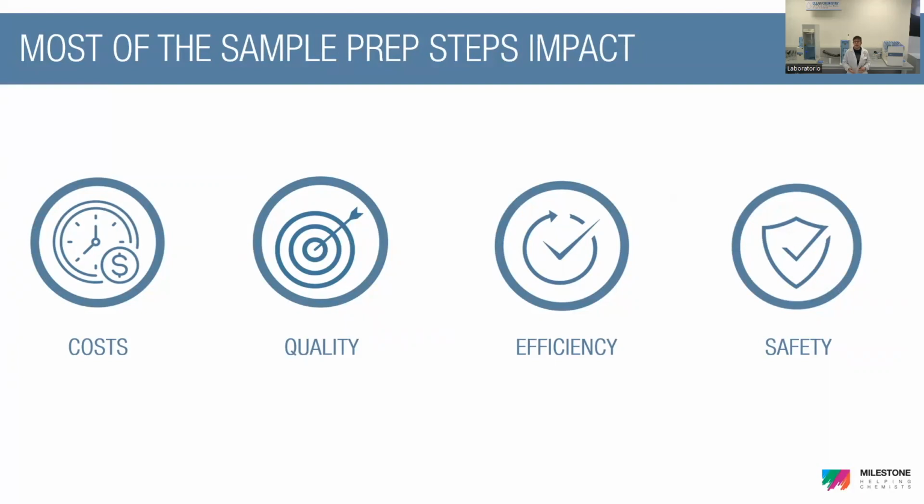Then if we consider efficiency, all the environmental labs are looking to make the sample preparation steps as automated as possible, and the optimization also means the possibility to limit the operator time, so to save time and free the operator for doing anything else in the lab.